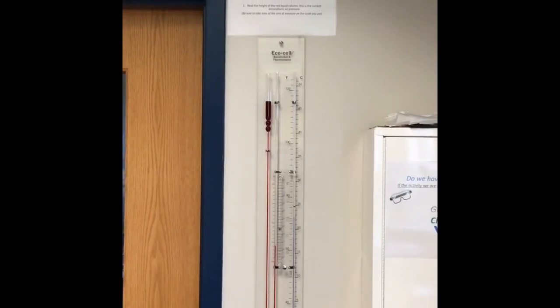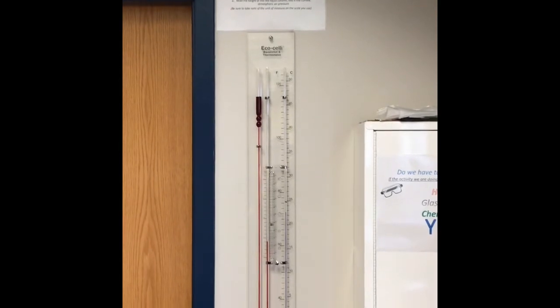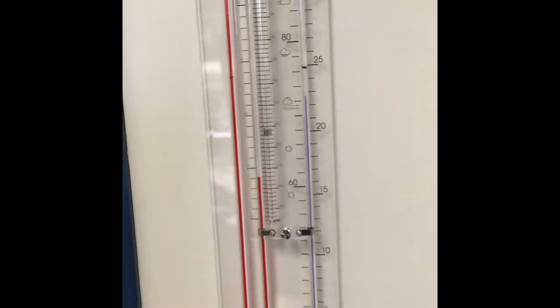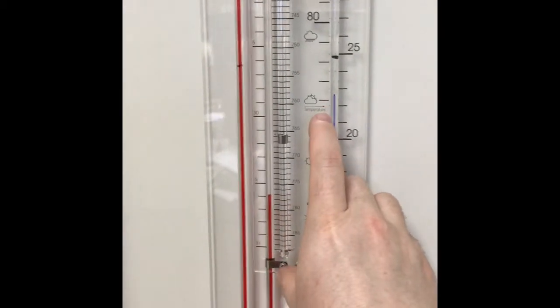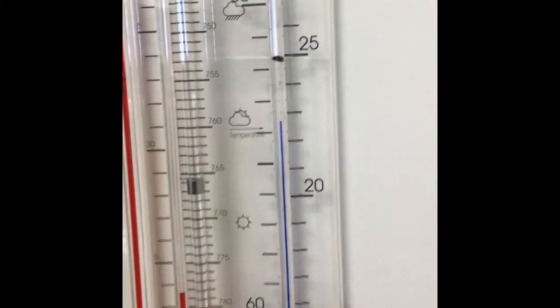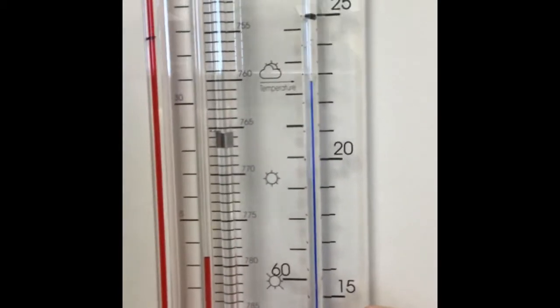To determine the pressure of the butane gas, we need to get the current atmospheric pressure using the barometer, which is located on the wall next to our goggle cabinet. And the way that you use this is you first have to move this slider so that it is even with the temperature. It's calibrated with the current temperature. So the blue column is your thermometer, and you raise that up until that temperature arrow is even with the blue liquid column.